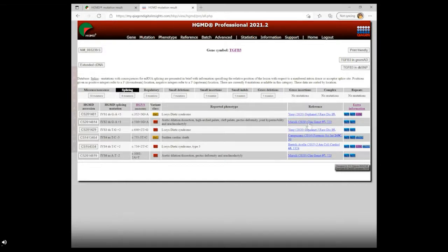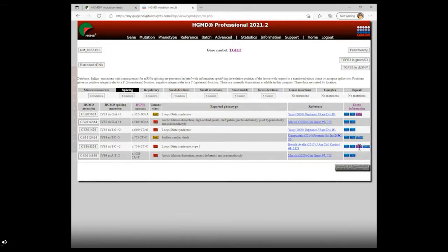The professional version also has an extra information column, which varies by variant. Here we can see the HG38 and HG19 genomic locations, and that this variant has been classified as a VUS according to ACMG classification criteria. Other variants have entries like a link to dbSNP or a comment noting that this variant causes an exon 4 skipping event. Clicking on a mutation link takes us to the full mutation entry page.